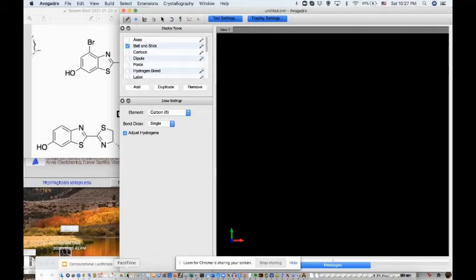Hi there. In this video, I'm going to show you how to use Avogadro to make a file containing your molecule of interest that you would like to dock into your protein.